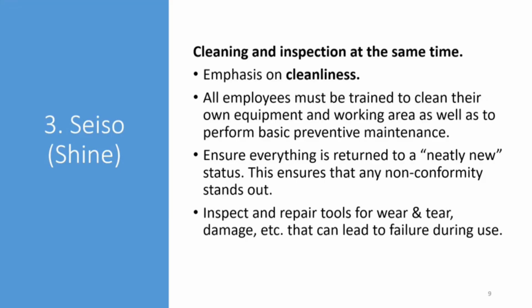The third level is called Seiso. It involves the cleaning and inspection of the workplace. Basically, after the organization of the workplace, we should also ensure that it is always kept at its best cleanliness level. The purpose is not only to make the workplace look nice, but also to make any problems or the equipment malfunction more obvious during visual inspection. For example, if the floor is very clean, then any leaks from the equipment will be very obvious, and then we can do the maintenance or repair of the equipment.